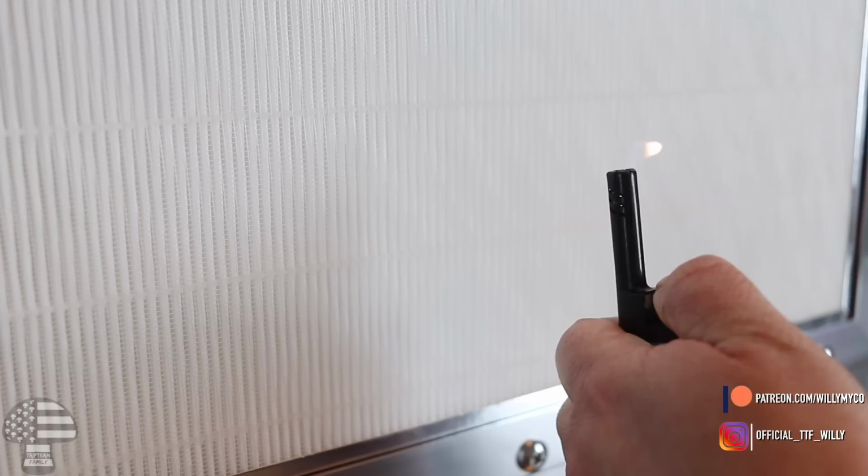What should happen is the flame should arch over 90 degrees. So it should straight arch over 90 degrees without blowing out, and the flame should be nice and steady. You shouldn't have flickering, and it shouldn't be bouncing up and bouncing back down. It should arch over a complete 90 degrees and stay lit nice and smooth. That's how you know you're getting laminar airflow and that it's not turbulent. This is a very easy, simple way to test out your flow hood. And as you guys can see, this one does that no problem.